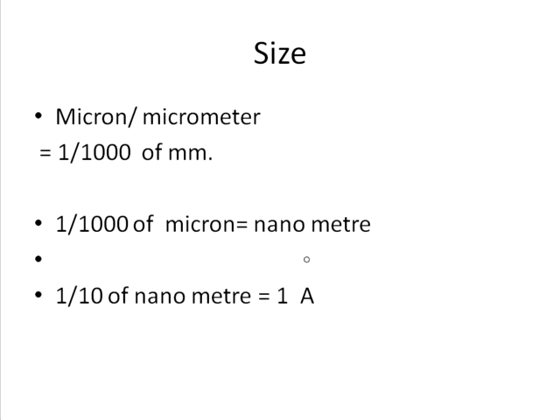Now, suppose you take a standard ruler, which is marked in centimeters. The first centimeter is divided into 10 divisions. You have 10 lines. Take the first two divisions, divide it by 1000 and take the first division in that. So that is 1/1000th of a millimeter. This size denotes a micron, which is used to measure bacteria. That is 1/1000th of a millimeter.